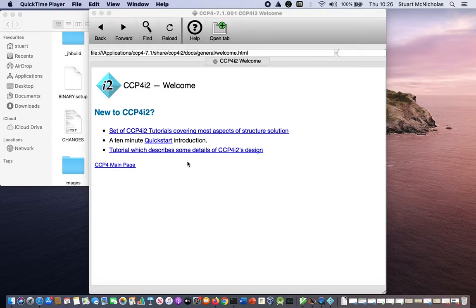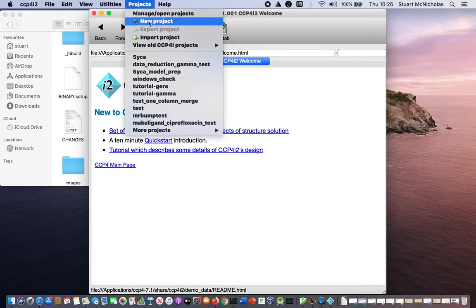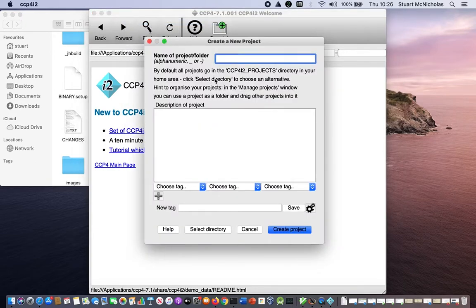The first thing we do is create a project to do our work. We do this from the Projects, New Project option. In the next dialog, we type in a name for the project. I'm going to call this one Video Demo. We could here type a description of the project to assist with our project management. We skip this time and just click the Create Project button.